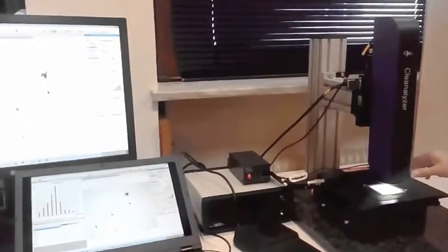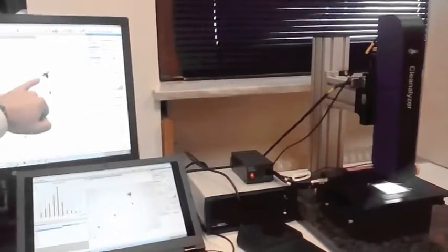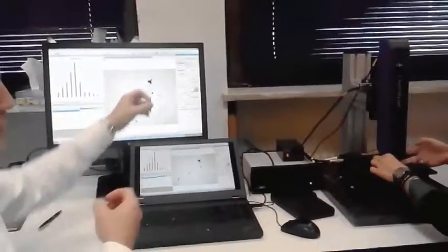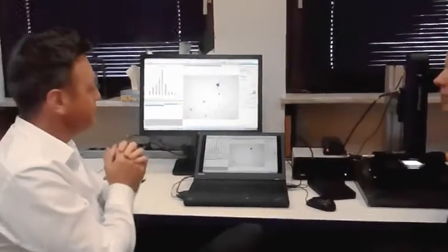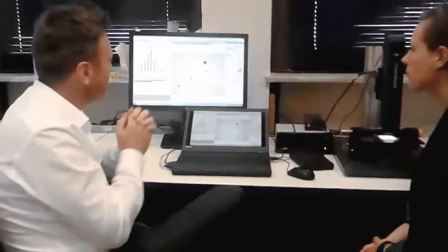Maybe you can see it already here. We have the polarizer on, so it suppresses the reflection, and here you can see that it's reflecting, so it should be a metal. The software will detect that from pass 1 to pass 2, the reflection properties of that particular particle changed, so it's very likely that it is a metallic particle due to that performance.